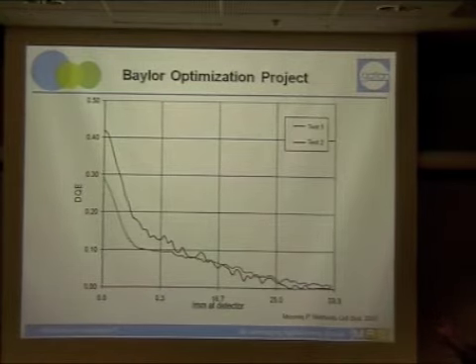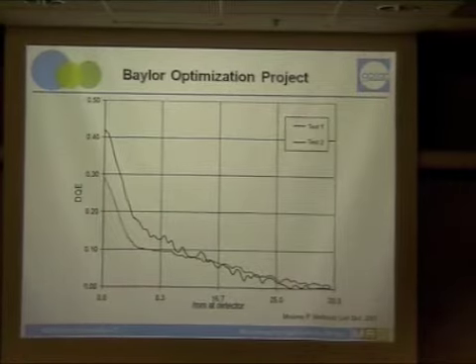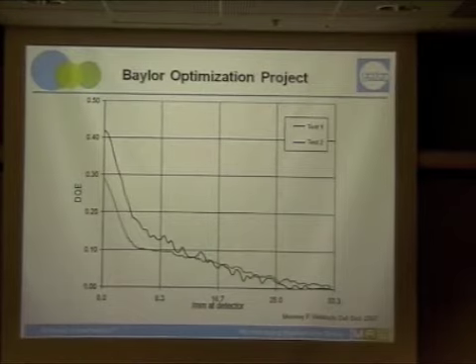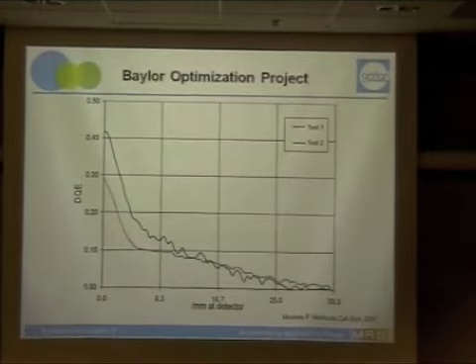It's hard to wrap your mind around what that means, but it is becoming essentially the standard for comparing. I would say the old frequency independent measure of DQE is really outmoded, and there's a lot more to gain from the frequency dependent DQE. I think that's probably what's most important for most people.